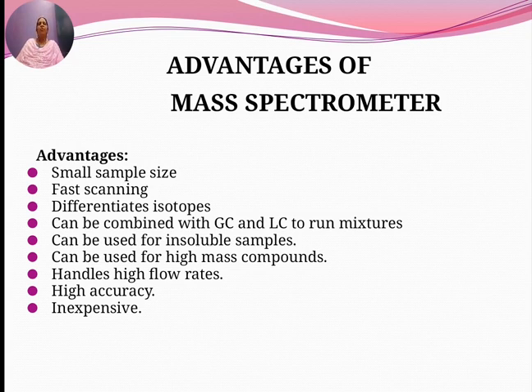They can be used for insoluble samples, for high mass compounds, and they can handle high flow rates. They have high accuracy, and they are inexpensive.